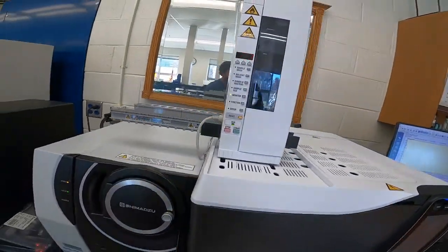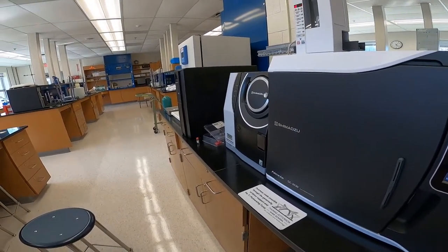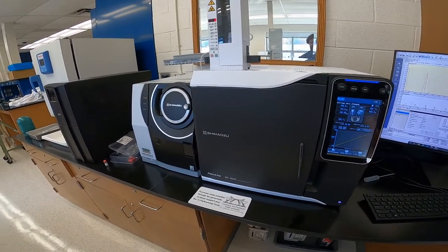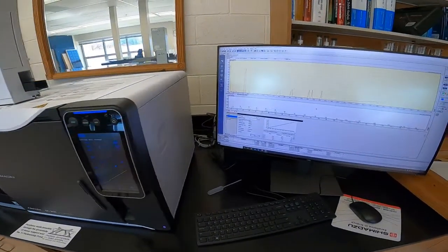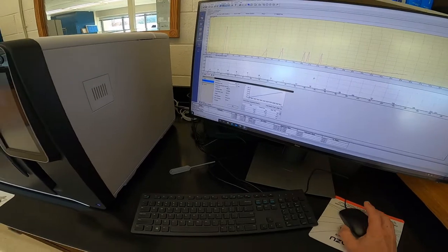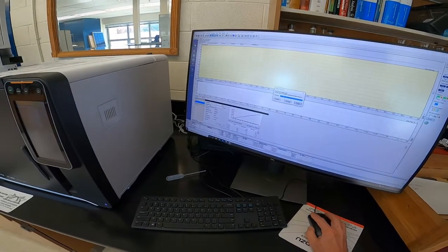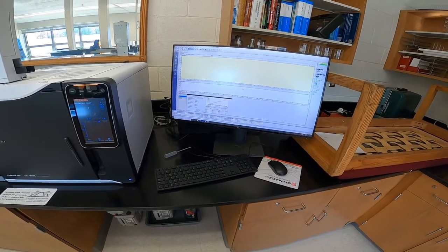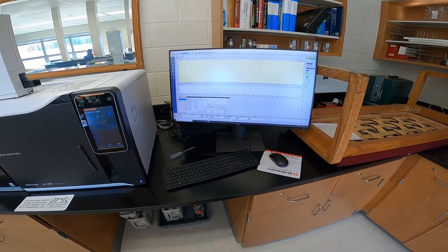So the auto sampler has vials to wash the needle with hexane and then inject the sample for us. So overall, as you learned about in chapter 12, the mass spectrometer has the gas chromatograph side to separate out the compounds, the mass spec side for the analysis, and then over here on the computer we'll have our data. So what I'm going to do is I'm going to download the program and run the sample. And it takes about 10 minutes for this sample to run. So I'll come back and show you the data and how to analyze the data when this sample is done.